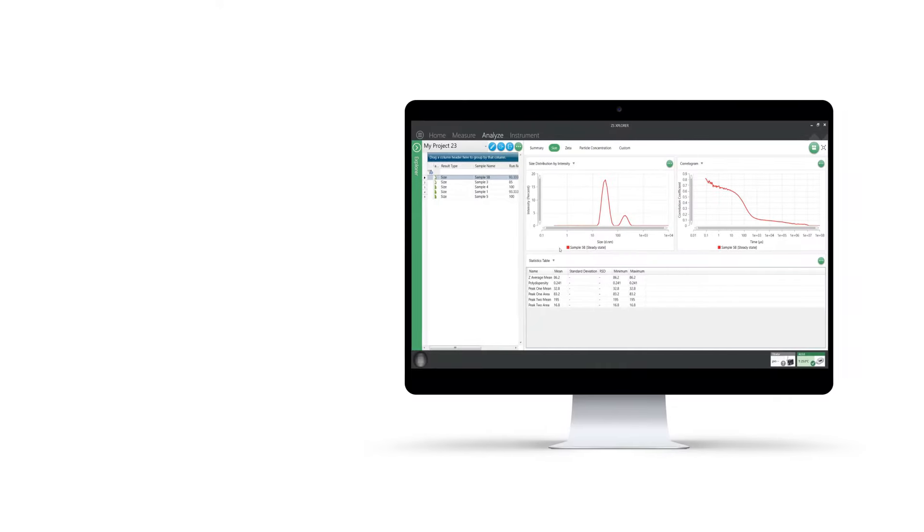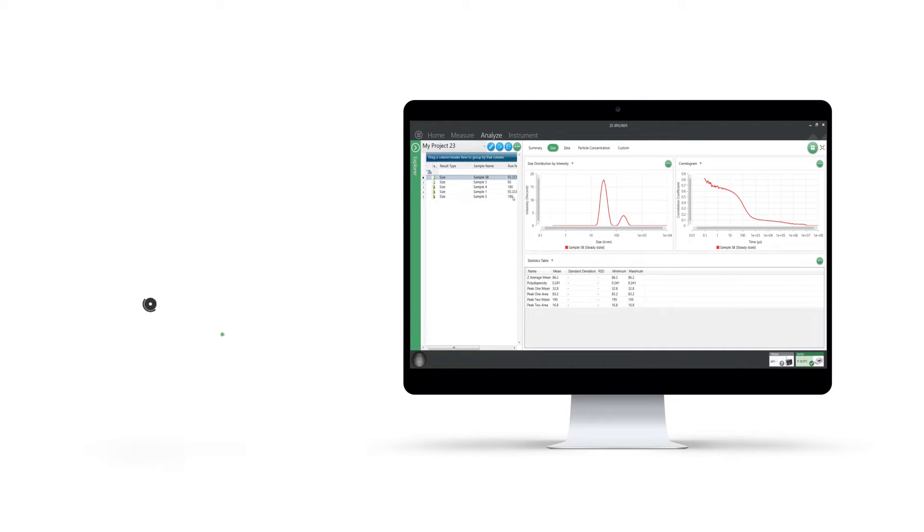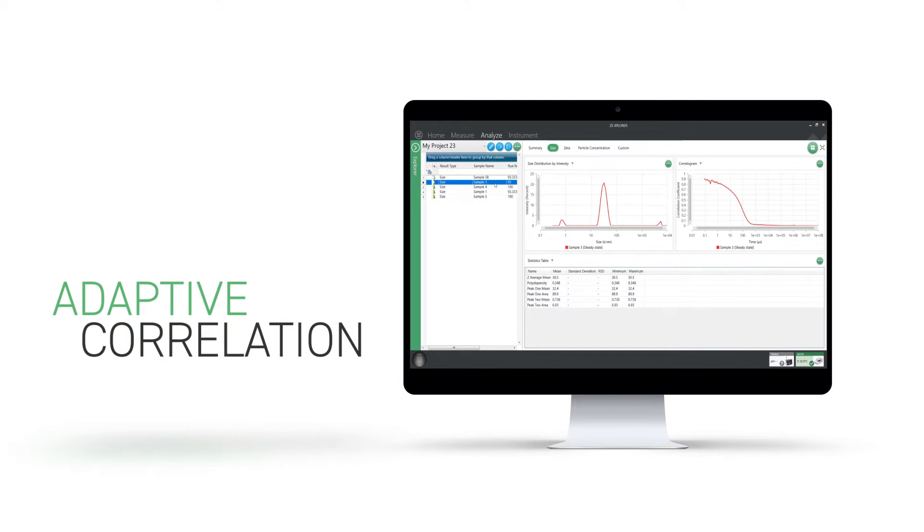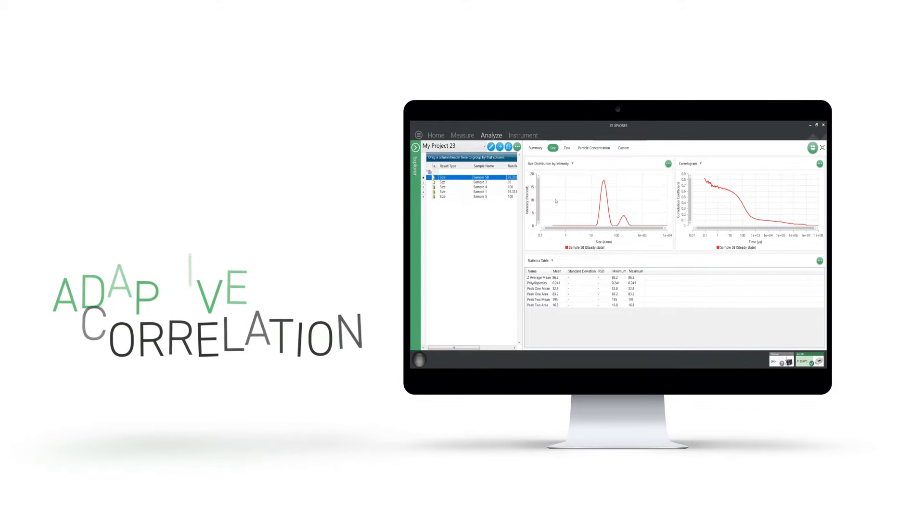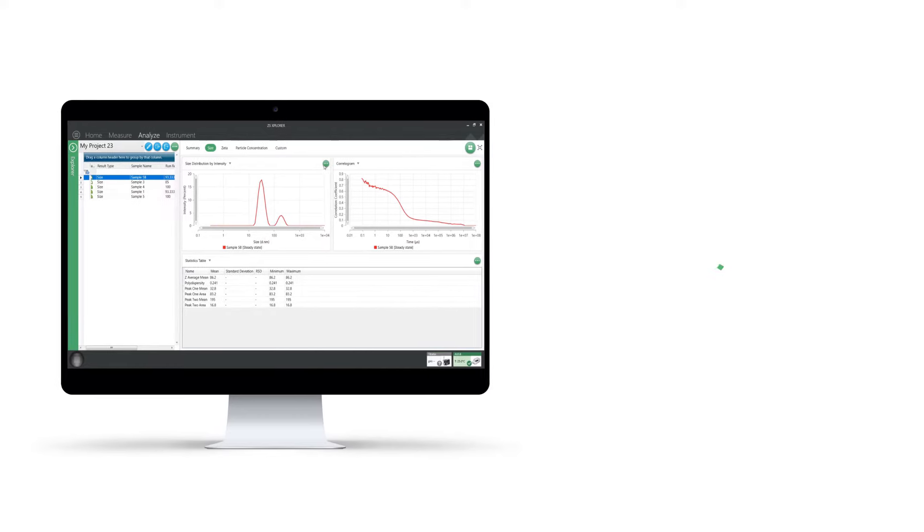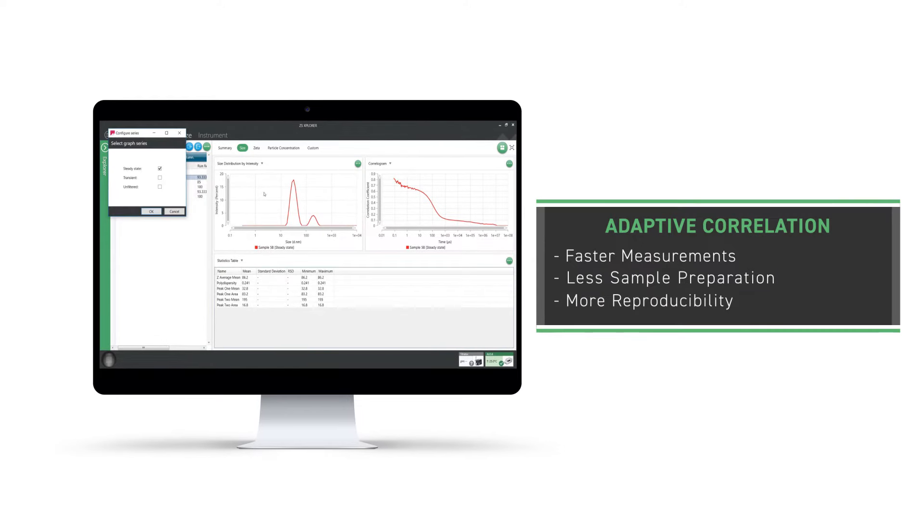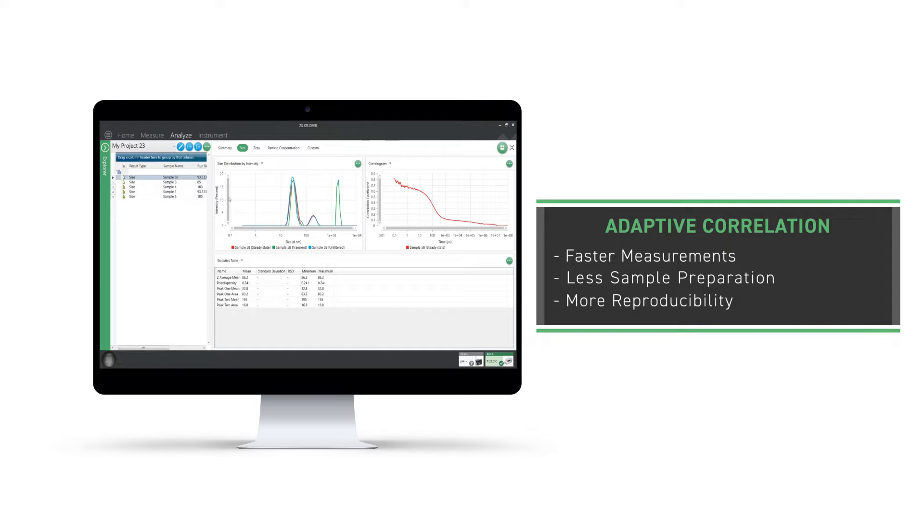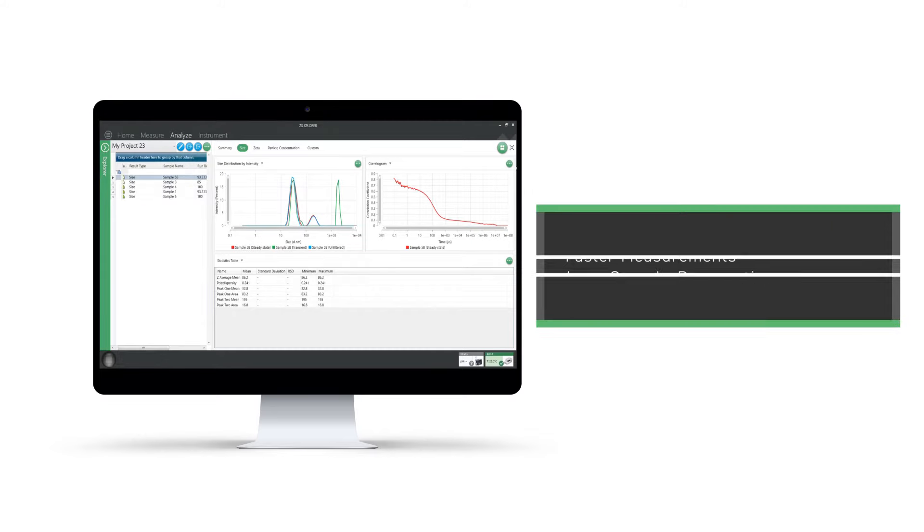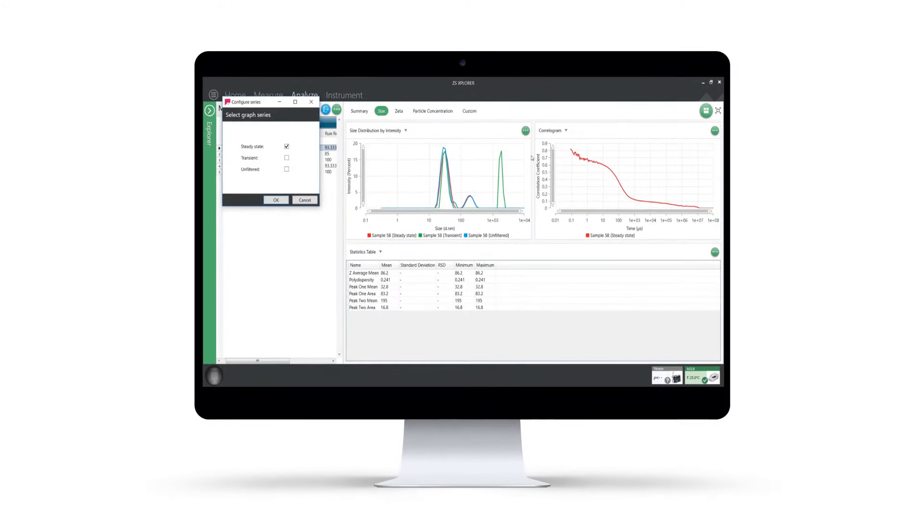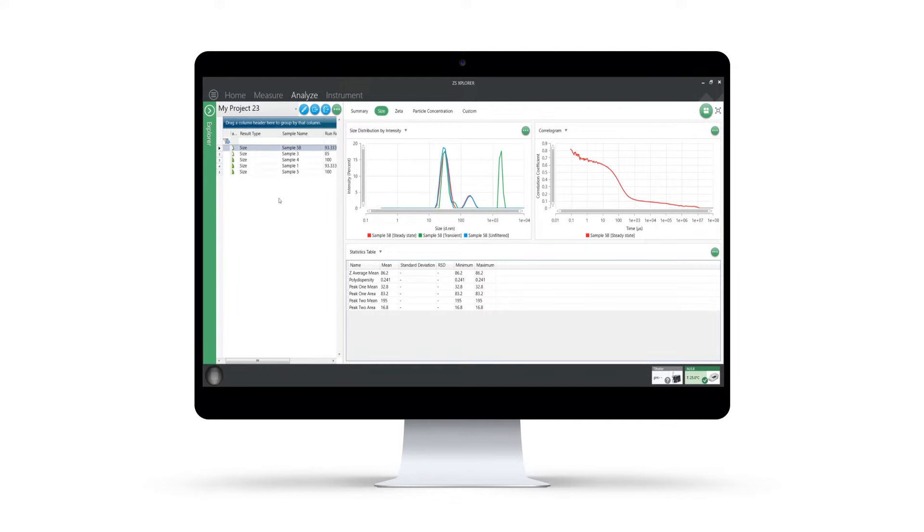Using a new analysis algorithm called adaptive correlation, it is now possible to get reproducible particle size data faster and with minimal sample preparation, leading to greater confidence in your results and decision making. This is achieved by separating sample signal from any external noise, such as that resulting from the presence of dust or other contaminants.